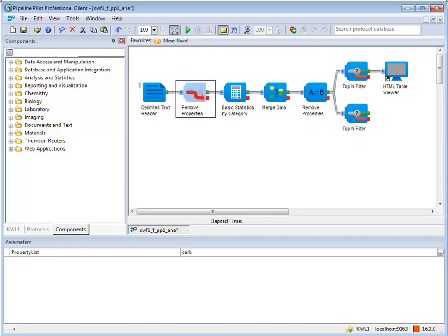The failed data state passes data through the component and out the fail port as if the component was not in the pipeline.